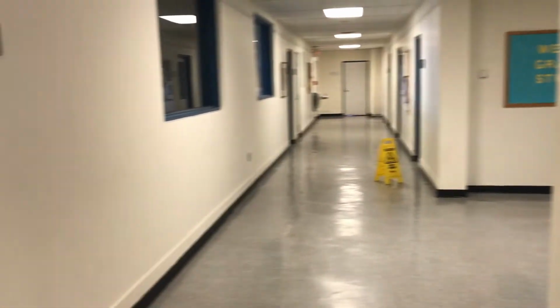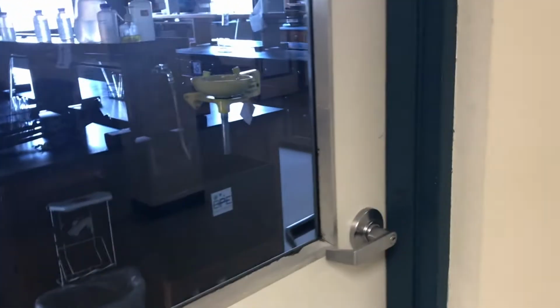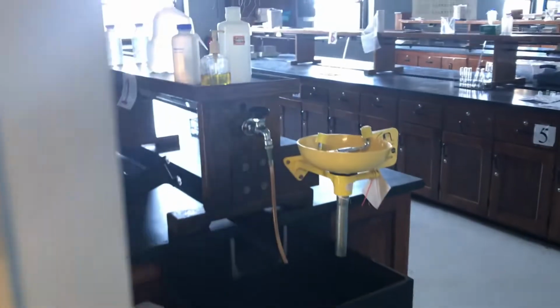Well, here we are. Welcome back to Cushing, everybody. Bet you never thought that you'd be missing the chemistry lab quite so much. Let's go in and check out this experiment.